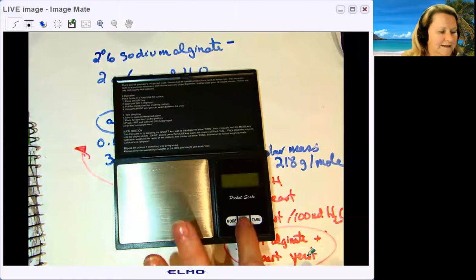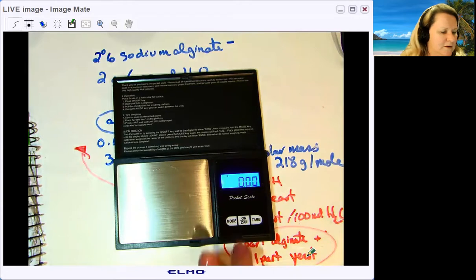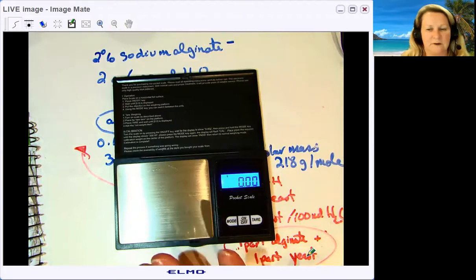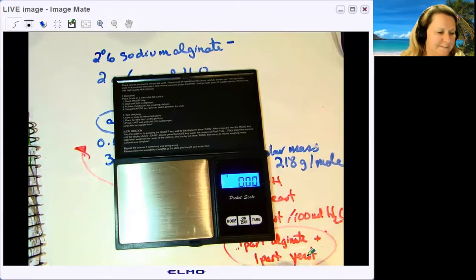One more thing I wanted to show you—the balance I use at home. I got this balance on Amazon for $10.99. It runs on two AAA batteries, has a capacity up to 500 grams, and measures to the hundredths place. This is accurate enough for AP Bio, though I don't think it would be accurate enough for my chemistry class, especially for quantitative work. It's handy to have at home if you're demonstrating labs to students. If your school has a budget and you're thinking of sending home boxes of lab supplies with students, this is worth considering.